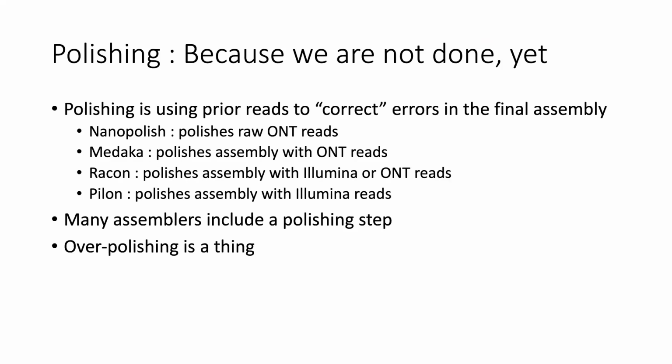When you do this, you have to be sure that you don't over polish. Many of these assemblers have parameters because of things they've noticed in their own sequences. So when you use out-of-date polishers and out-of-date assemblers, you can put errors back into your sequences.